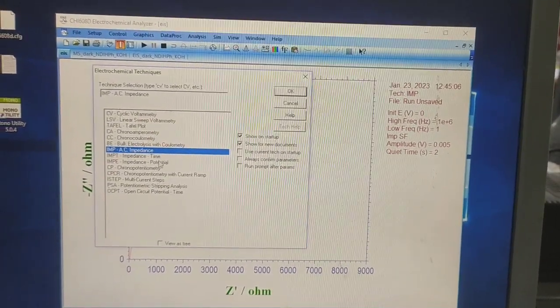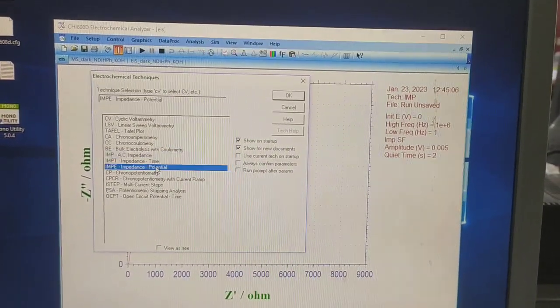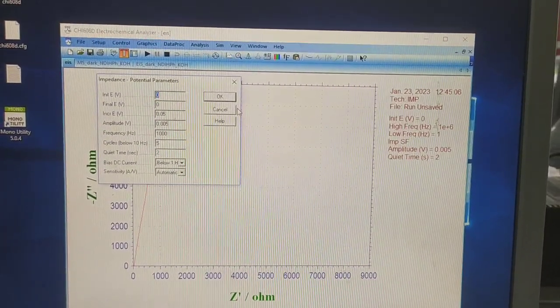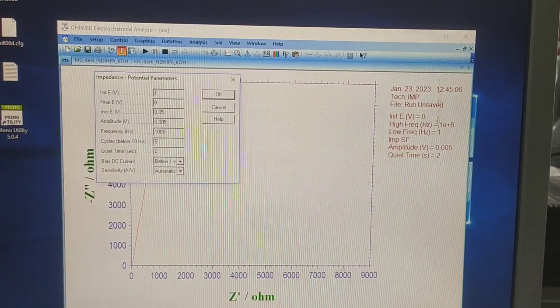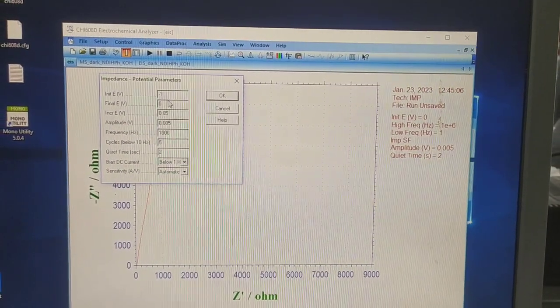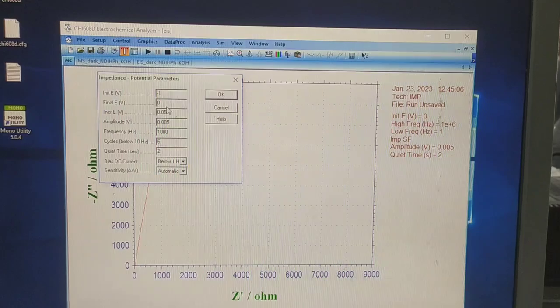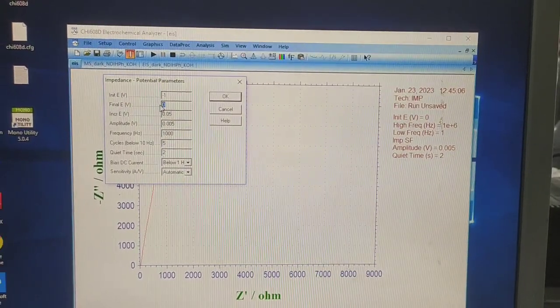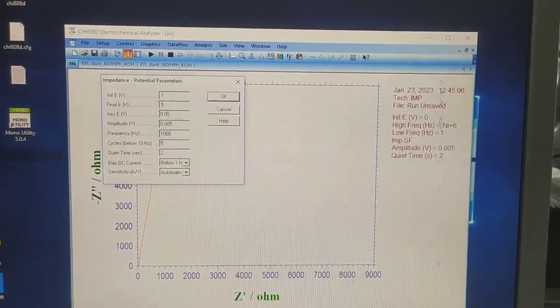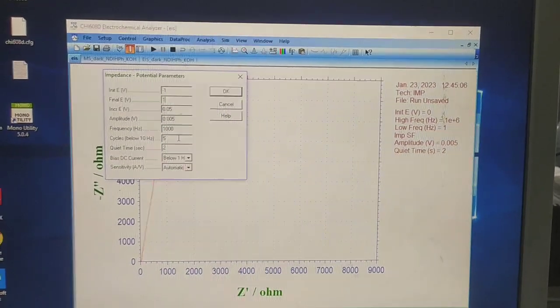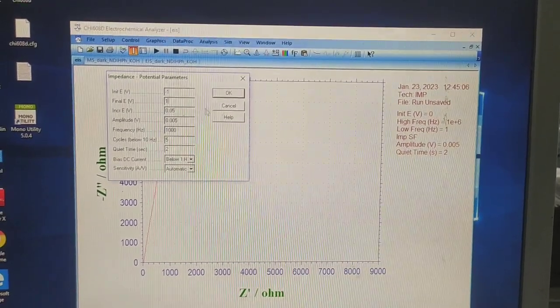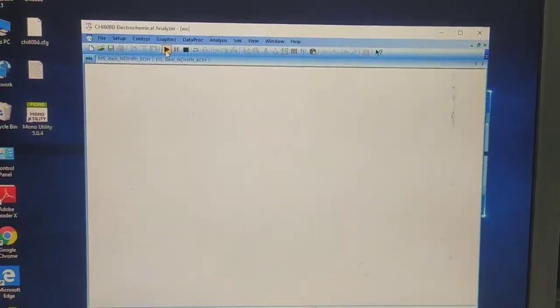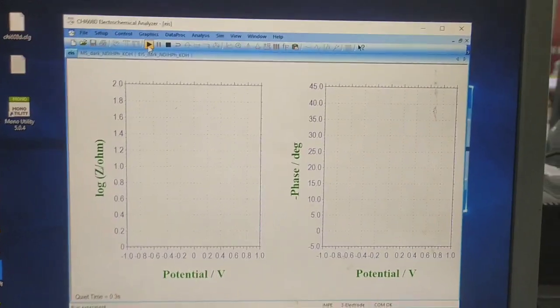Now let us record another experiment, that is impedance versus potential. Let's take the initial voltage minus 1 and final voltage 1, and the rest of the things we don't need to change. By recording this experiment we can plot the Mott-Schottky plot.